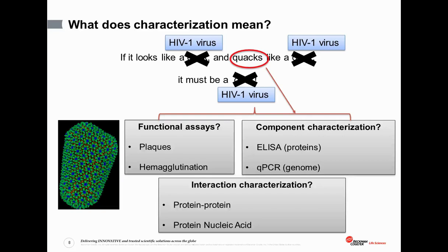You talk about characterizing interactions. And now you're actually looking at something more interesting. You're perhaps thinking of how do protein-protein interactions between the virus and the host cell occur, or how do protein-nucleic acid interactions occur. And that's an entirely different type of question to ask and requires a whole battery of instruments to answer such kind of questions.